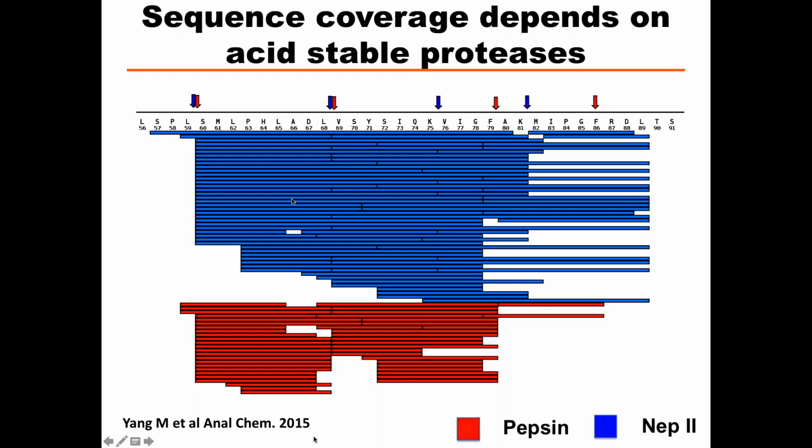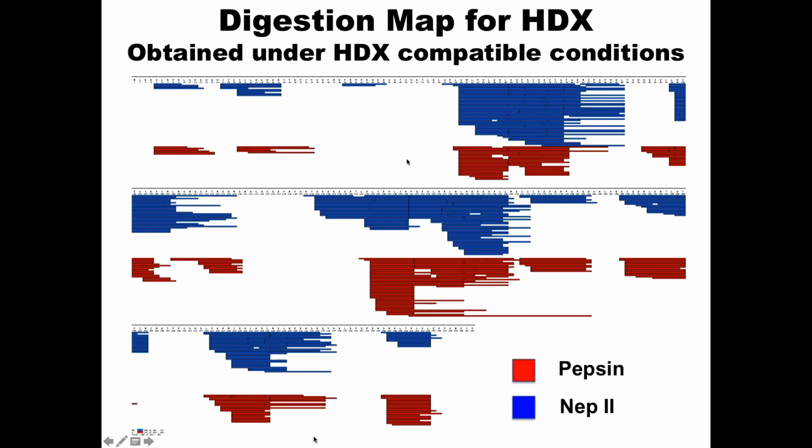So now it's like the sock in the dryer. Every one of these peptides has got to be there somewhere, right? So there could be a couple of reasons. I think I don't really show the valving, but there's a series of valves here. So small peptides may be just lost and never brought into the mass spec.